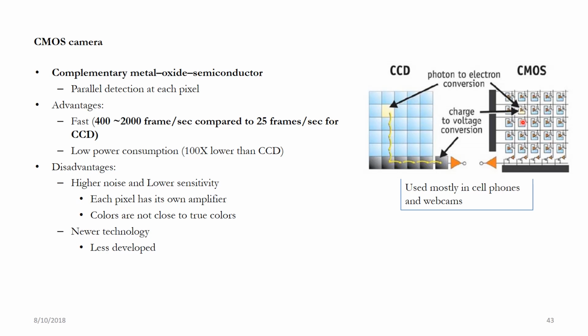If you are trying to detect a really teeny weeny signal in a lot of noise, then CCD is the way to go, or EMCCD. But if you have a lot of signal and you want speed, then CMOS is the way to go. And nowadays sCMOS, or scientific CMOS cameras, have even lesser noise, so that way you can get really great images.